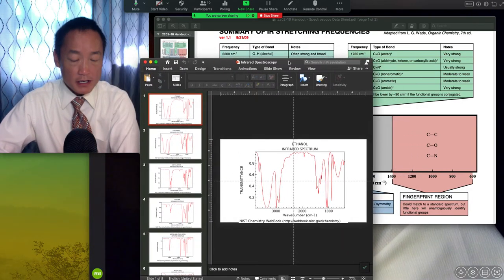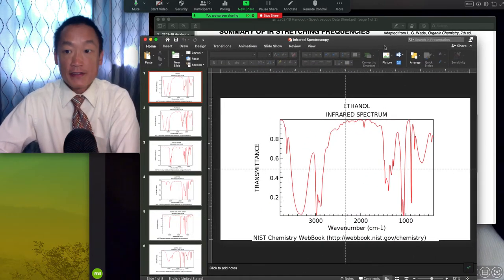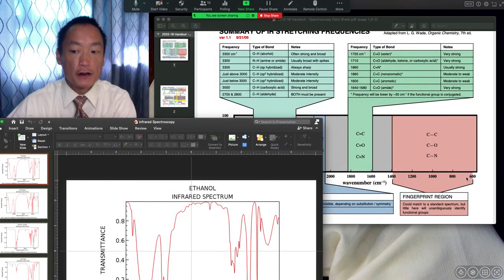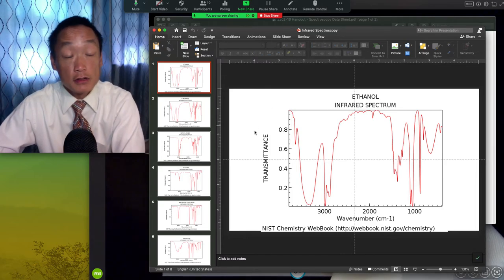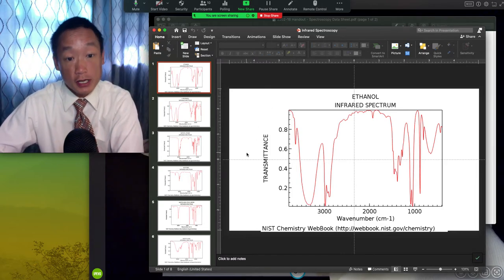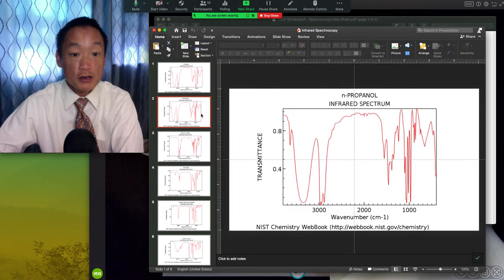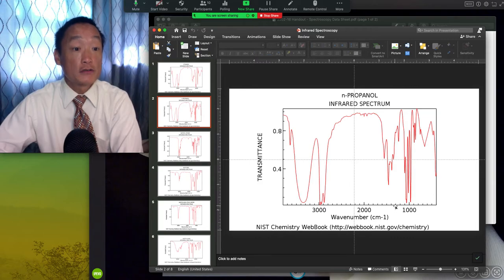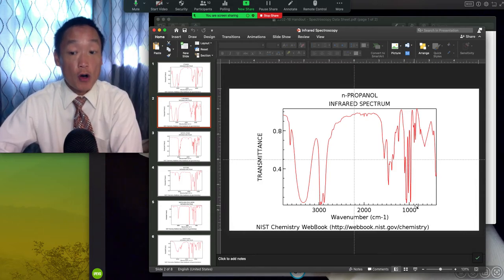There becomes a point that occurs in our spectrum where things get insanely busy. And that's this region that's highlighted by something called the fingerprint region, which exists between 600 and 1,400 inverse centimeters. At that point in time, we are getting to the energies of bonds and molecular motion that are all very much tuned specifically to the molecule. Ergo, that region of the molecule, from here up to about here, consists of peaks that are solely unique to that molecule and can be identified through this region. But what that also means is a lot of peaks are going to show up in this region.